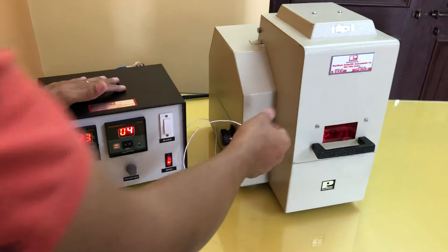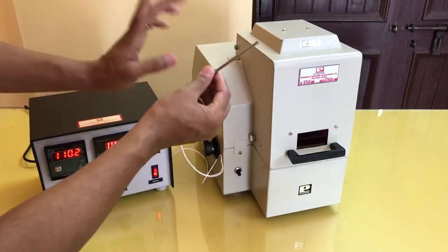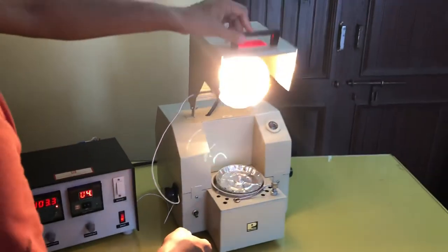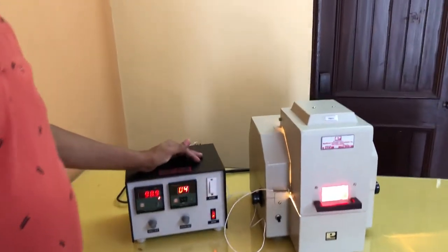This is a PT-100 type sensor, and this special coating is there. This is all about the infrared moisture balance. Thank you.